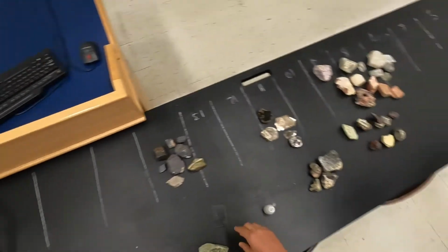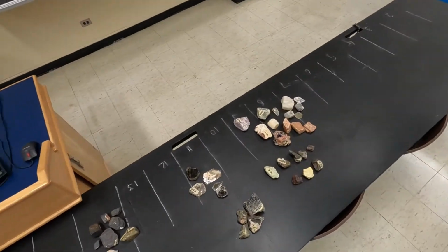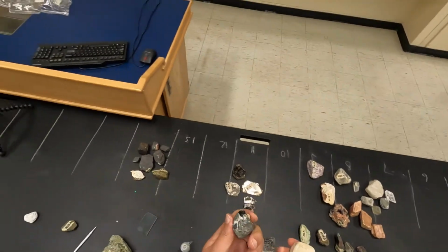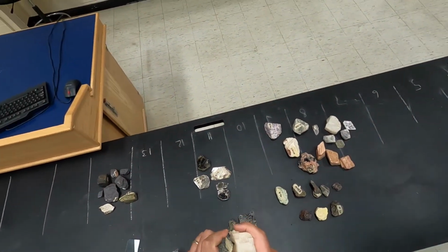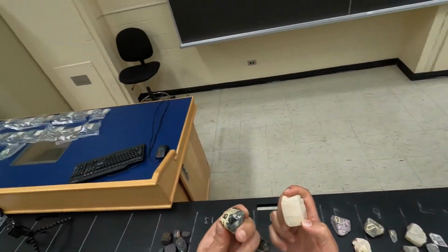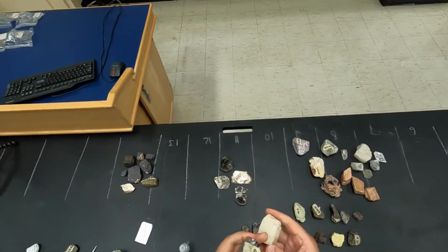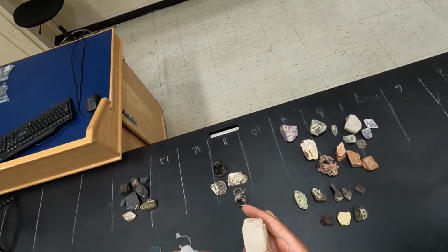Okay, so the hardness, it's a key distinguishing factor. One thing I didn't mention is that we can take other minerals and scratch essentially one mineral against the other and see if it does a scratch. And you can see clearly that I'm scratching basically with a spinel this other mineral, and yeah, in this case this could be something that fits this.